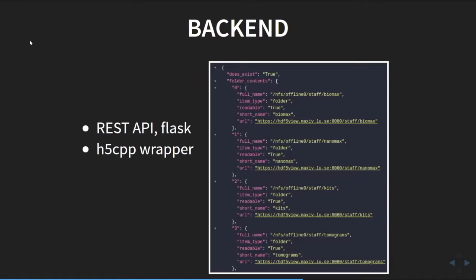Yeah, and it helps to make it a bit faster. And as was mentioned not long ago, I use the HDF5 plugin to decompress some of our images that come out of some of our detectors.